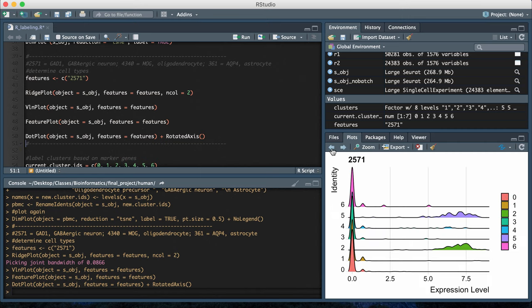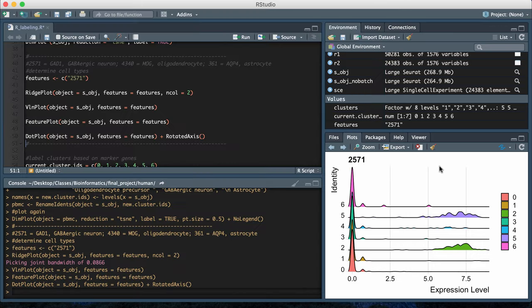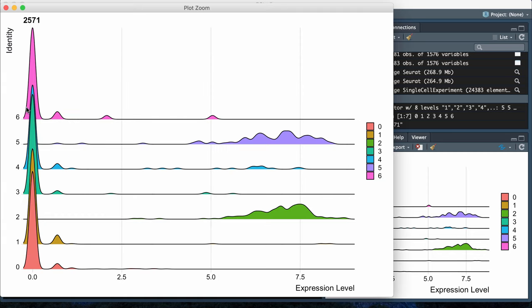The first one was a ridge plot, and it will basically show you a distribution of the genetic markers. Again, I'm looking at 2571, which is for a GABAergic neuron, and this should show you the distribution of that particular gene in the seven clusters.